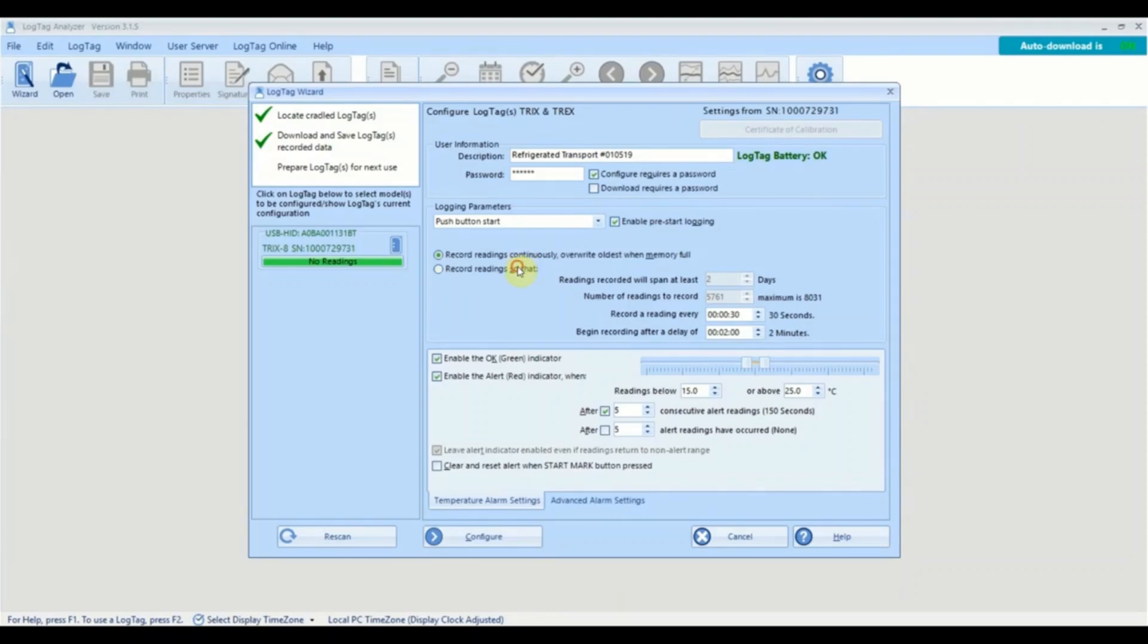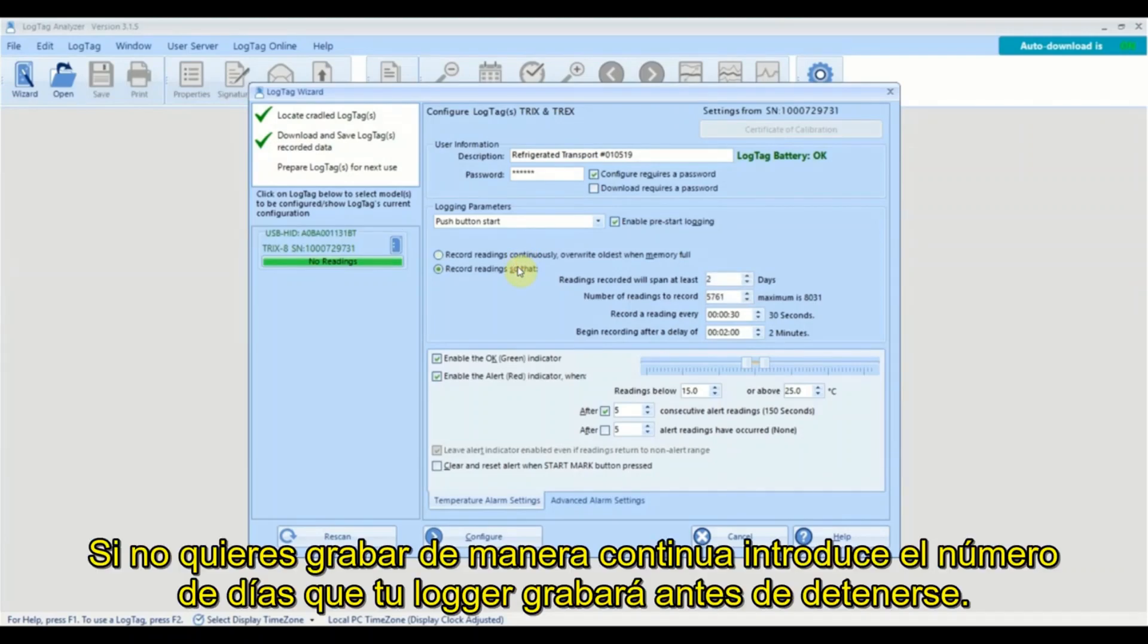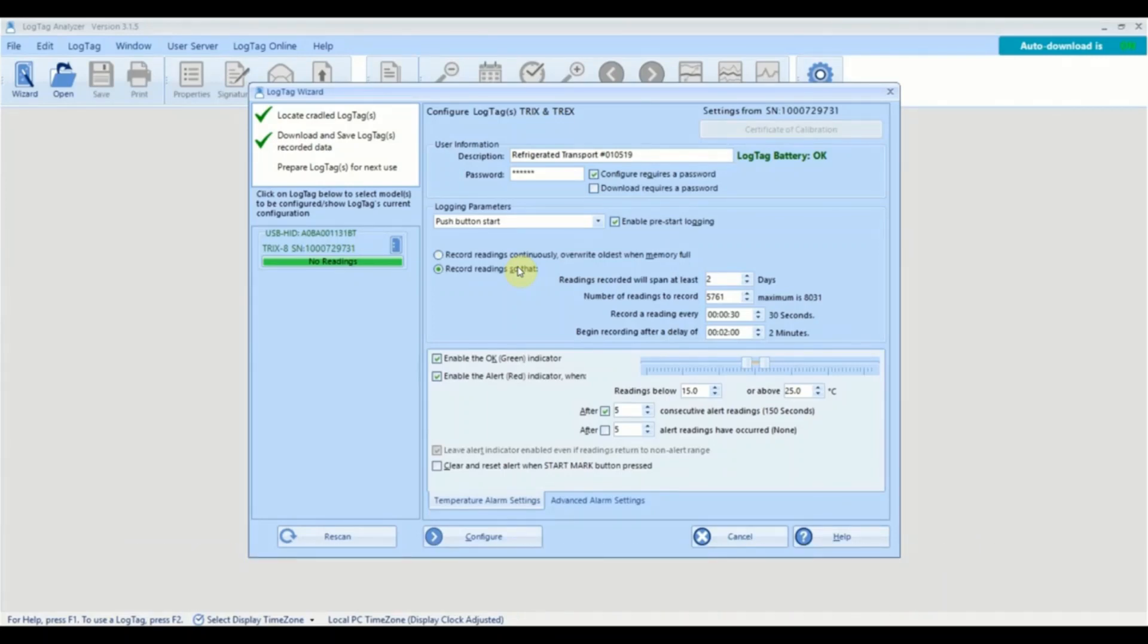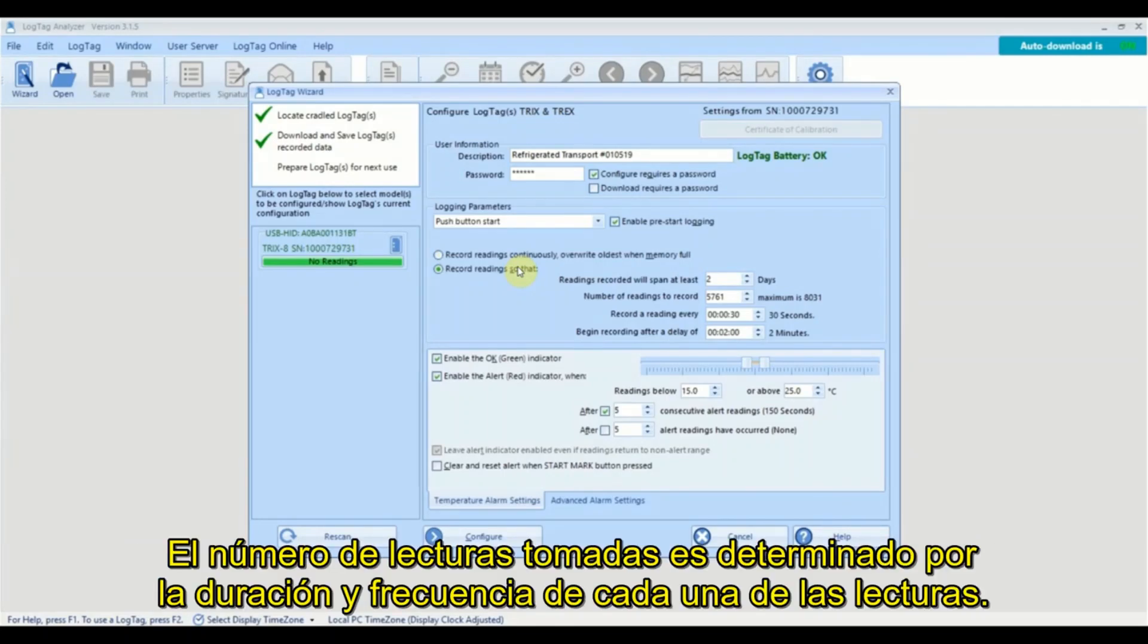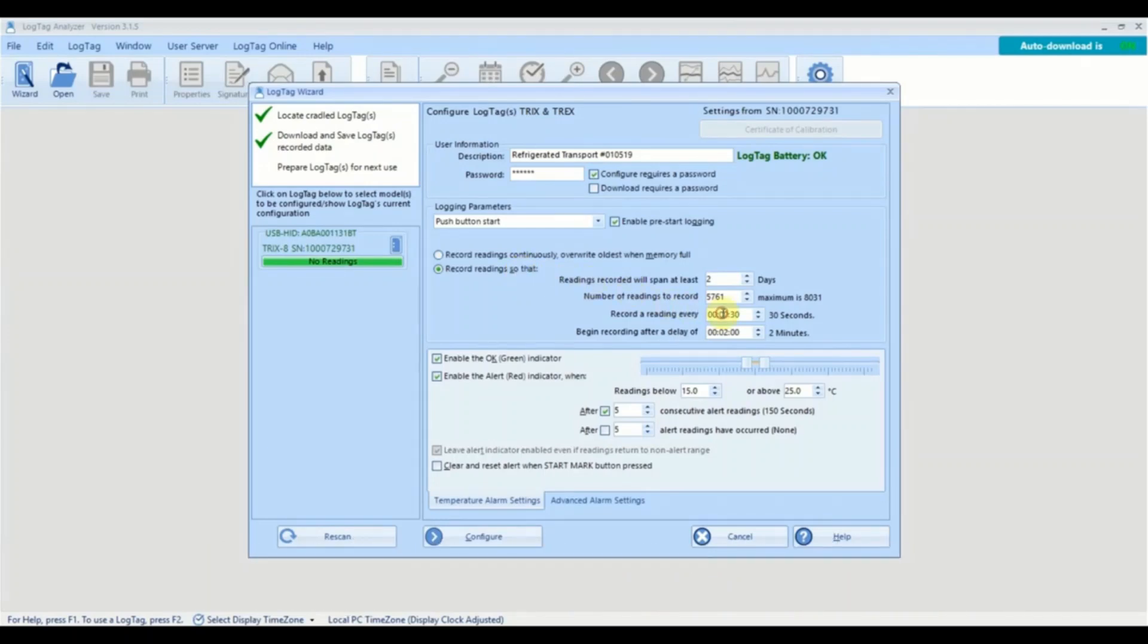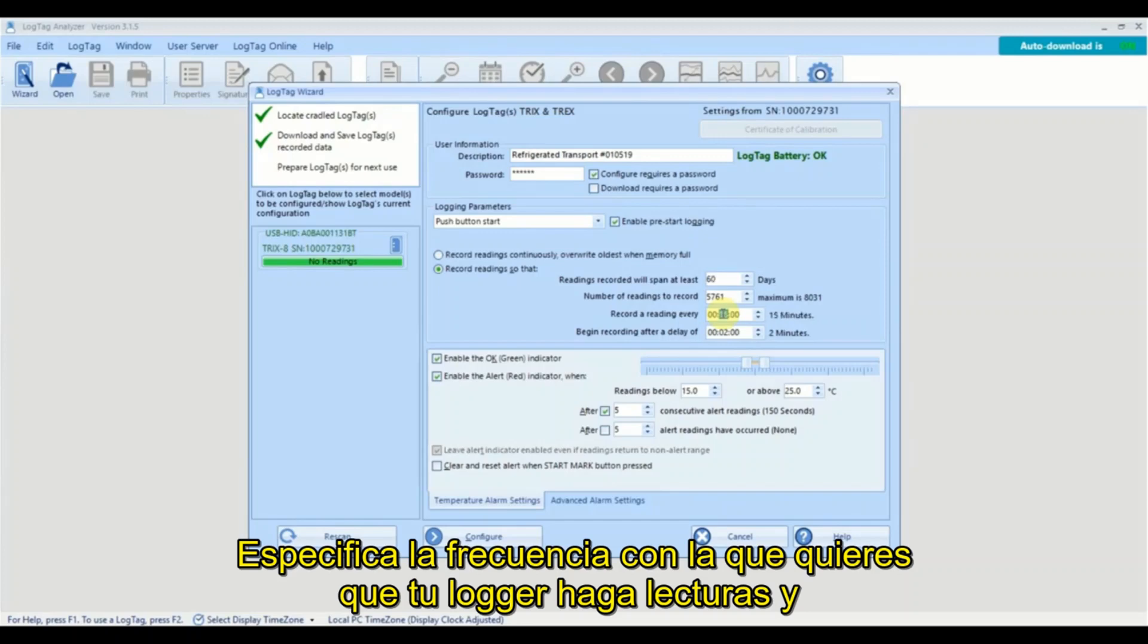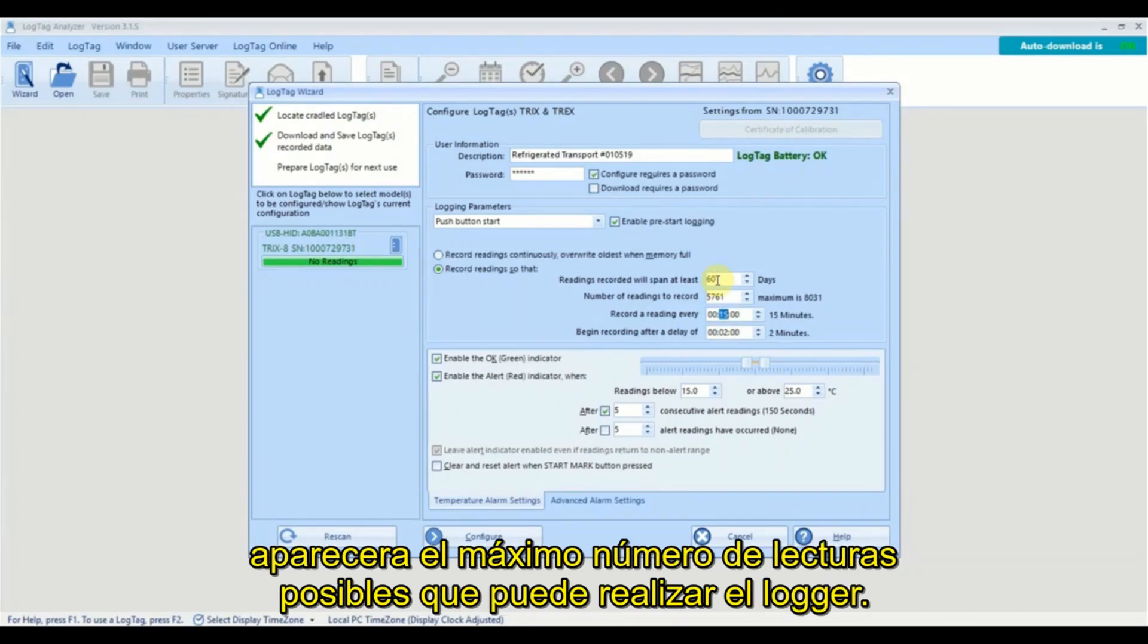If you don't want to record readings continuously, enter the number of days your logger will record for before stopping. The number of readings taken is determined by the duration and frequency of your reading. Specify how often you want your logger to take a reading and the maximum number of readings the logger can take will be displayed.